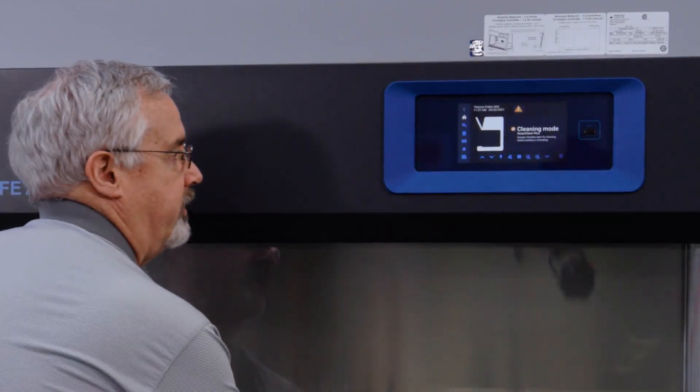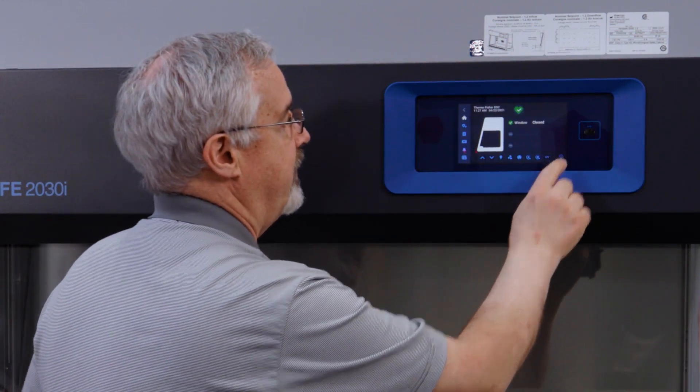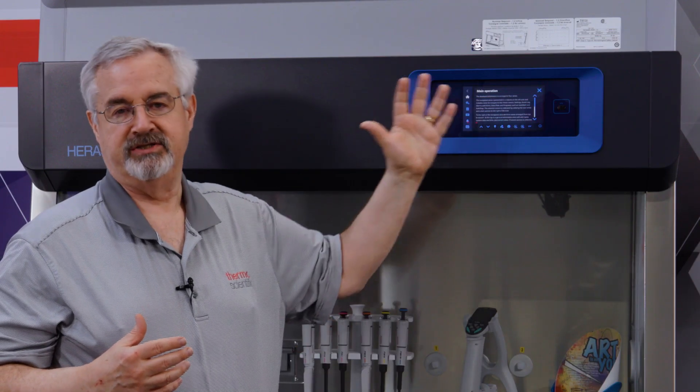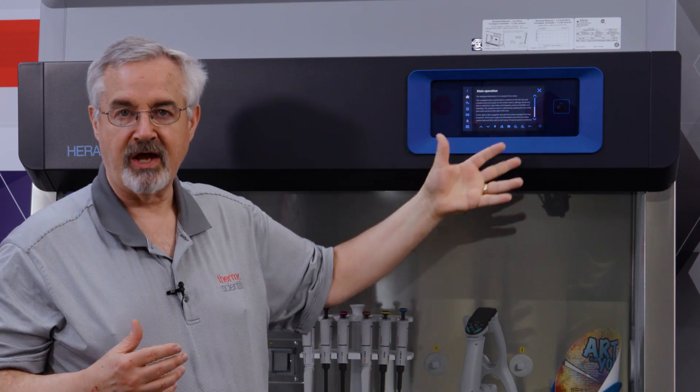One other thing I wanted to mention is the information key. Each screen has an information icon, and if you press it, it will explain what the particular screen is addressing, what choices you have, and the best way to use it. That is also language sensitive, so if you've selected a language other than English, you'll find that information in your chosen language.